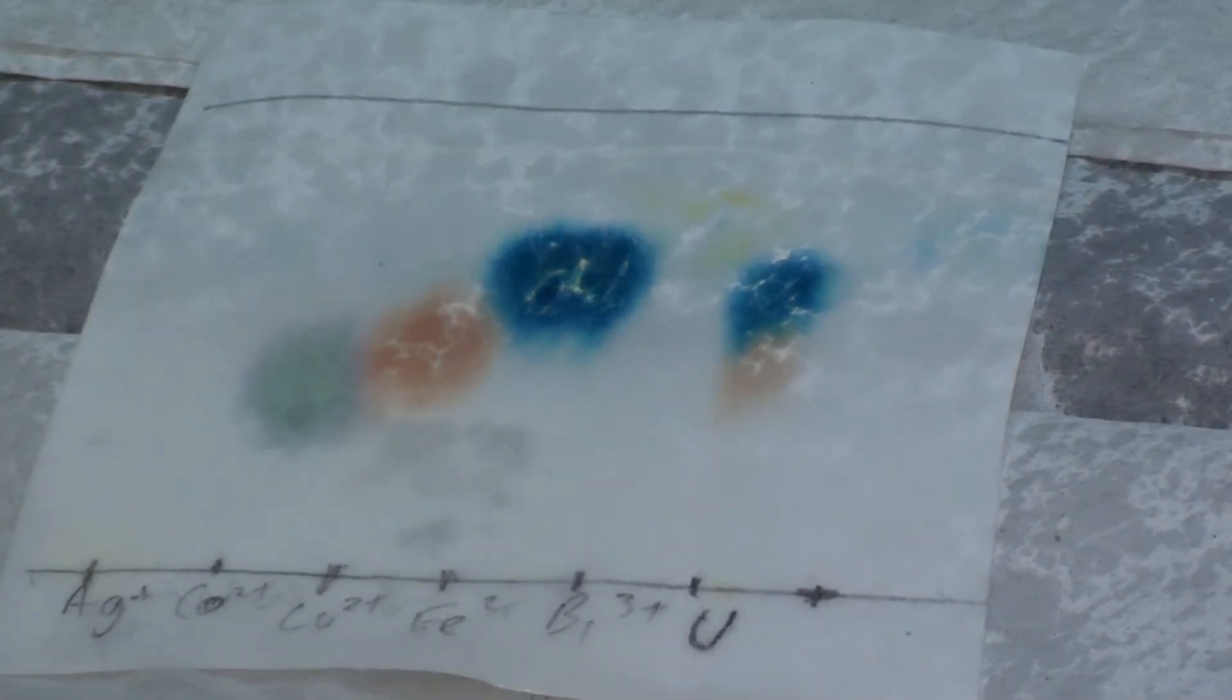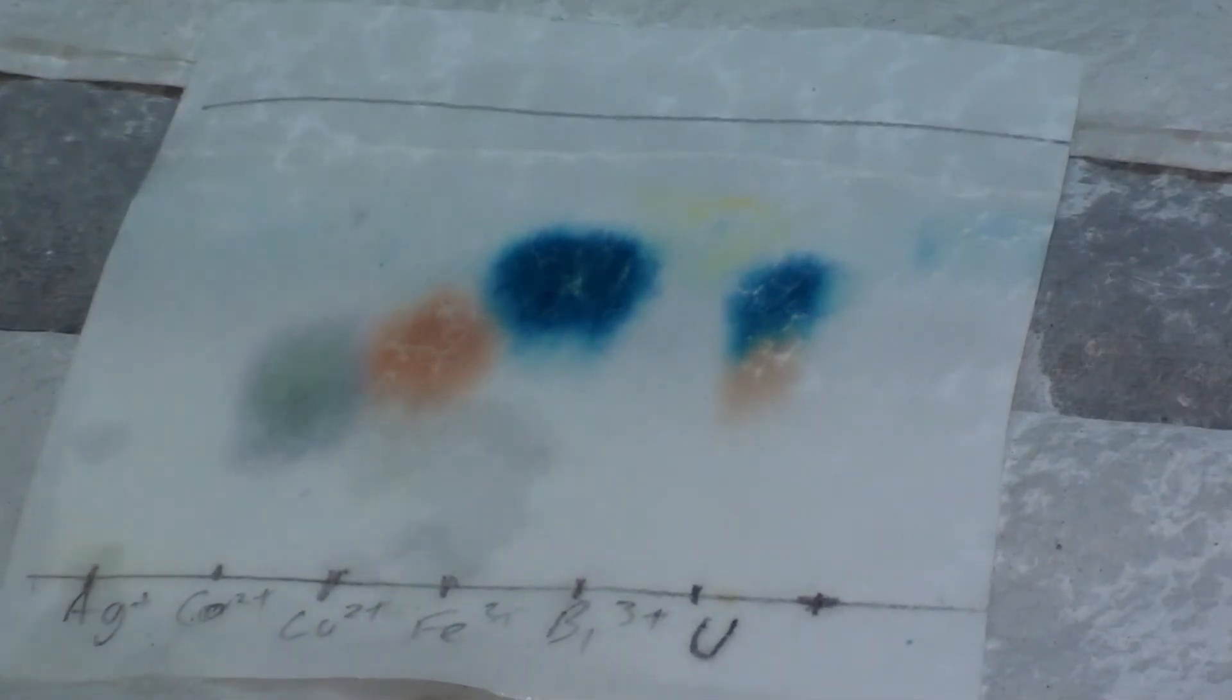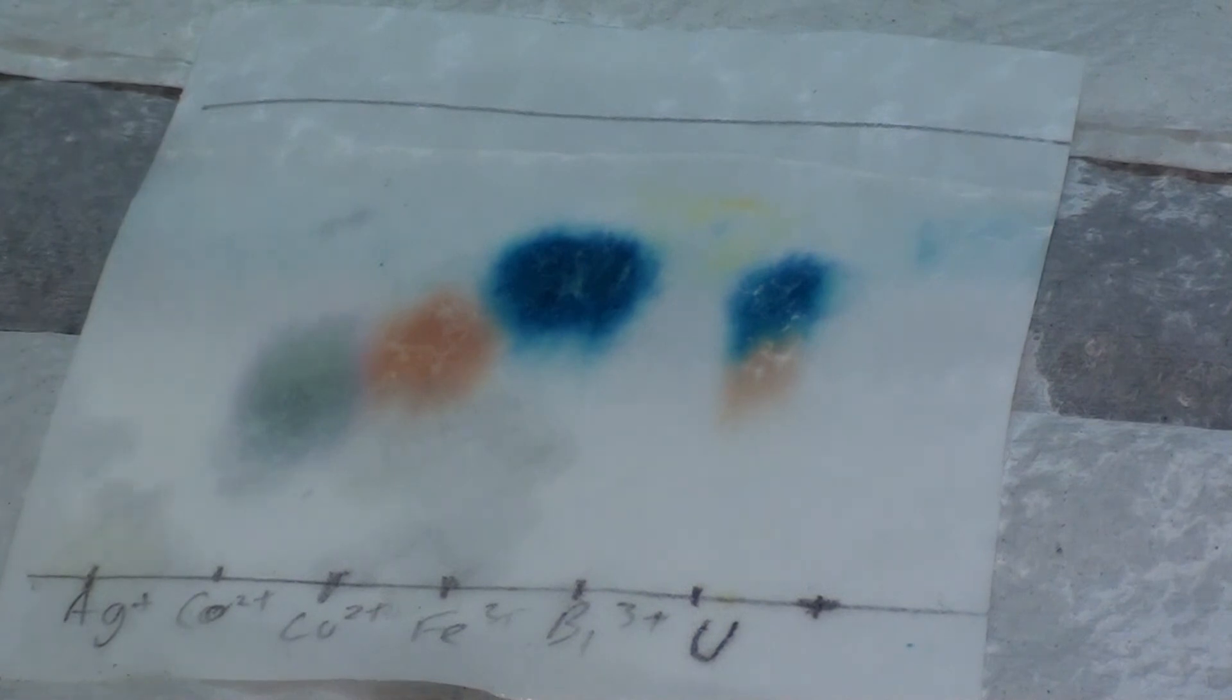So now what I'm going to do is I'm going to stain the TLC paper or the plate. And I've got this staining reagent right here. And I'm going to just go ahead and spray the plate with it and it will make some of these things turn different colours. Now what I'm going to do is I'm going to go ahead and dry this.